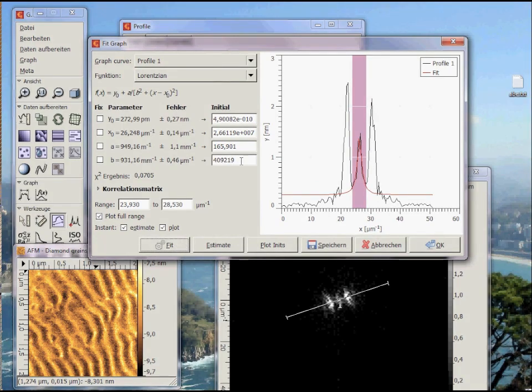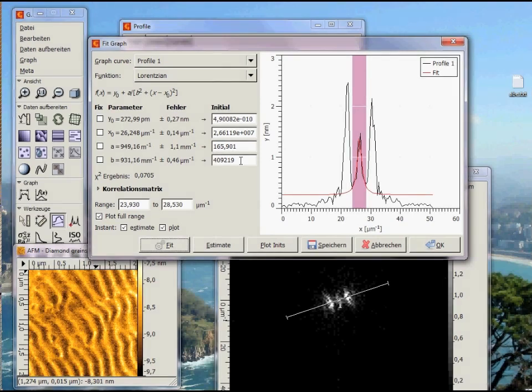That means the waves in the AFM image are separated by roughly 120 nm from each other.